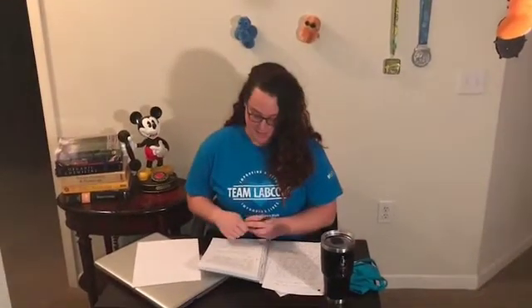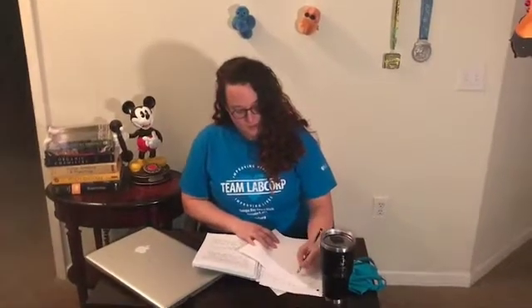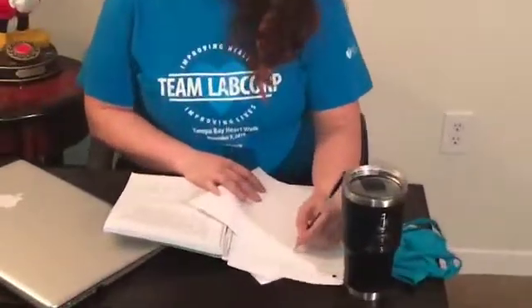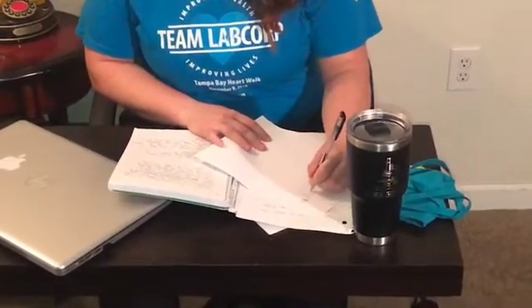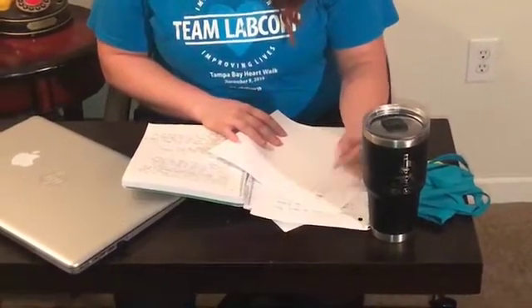Using a spectrophotometer, in this case we'll use an absorbance at 595 nanometers. We'll first blank it, and then you will measure your protein standards of concentrations. The protein standards we use here are bovine, which are cattle proteins. We use those and PBS to blank it. Once all the measurements are recorded, you'll have your table. So we'll say, I don't know, standard one will be what? Your 0.125, your 0.25, and 0.5.